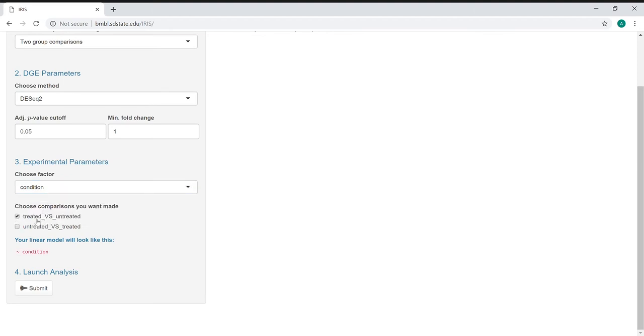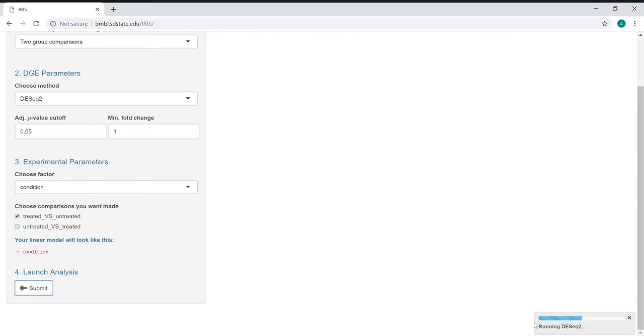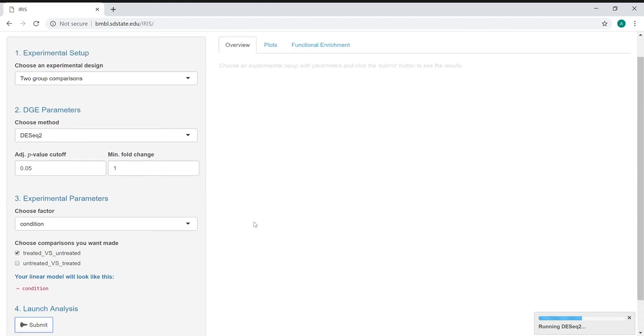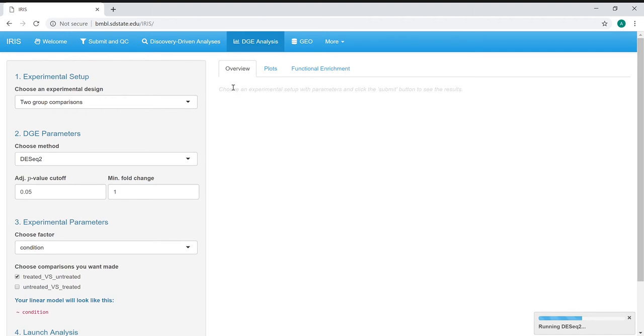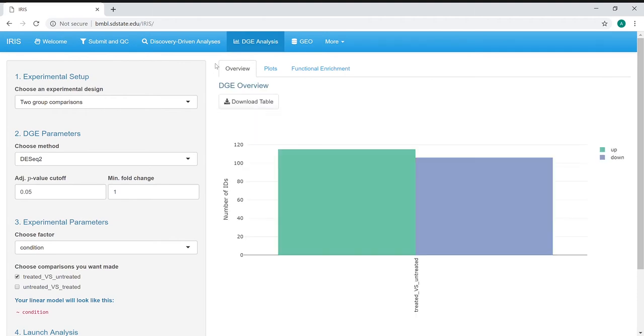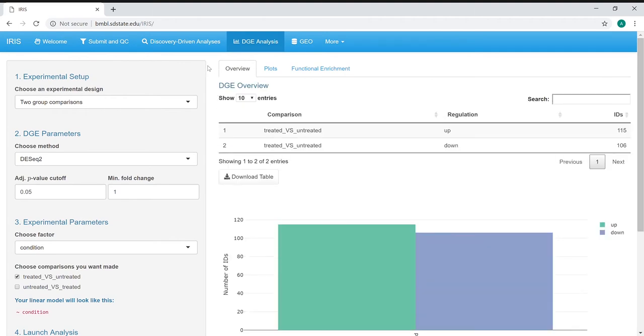Here, these are the exact same comparison, just inverted, so we'll just select one of them. It also gives us a look at the linear model, how it would actually look. Once we've made all of our selections, we can submit the analysis, which will then run the DESeq2 program to do the actual comparisons. This is also sometimes time-consuming depending on the size of data you have, so you might want to be patient.